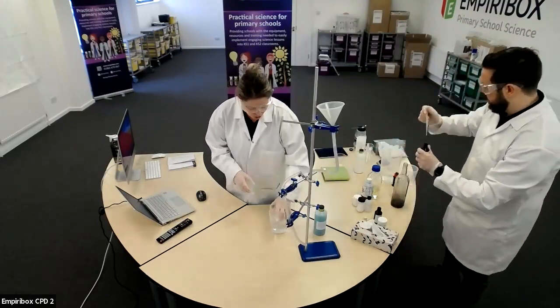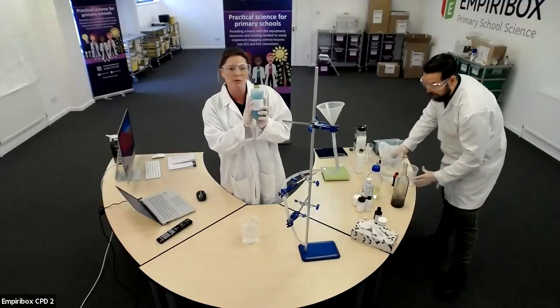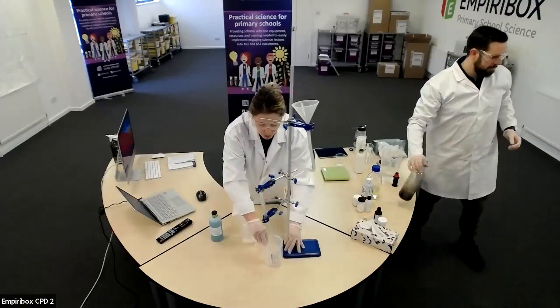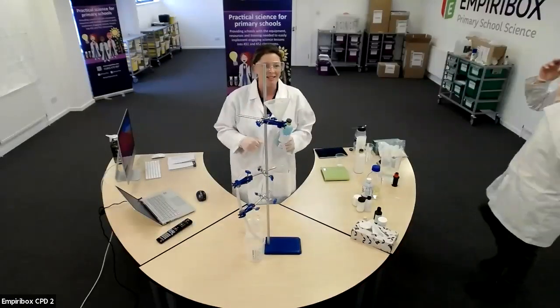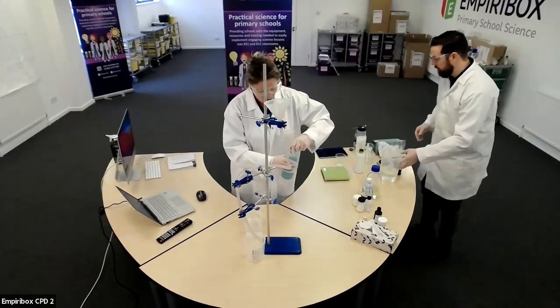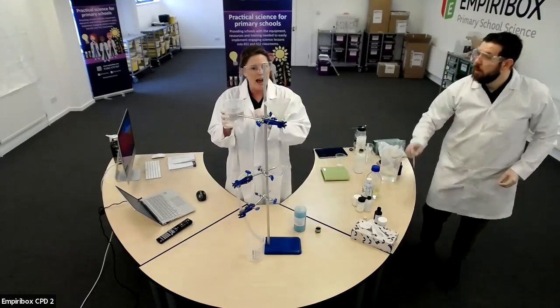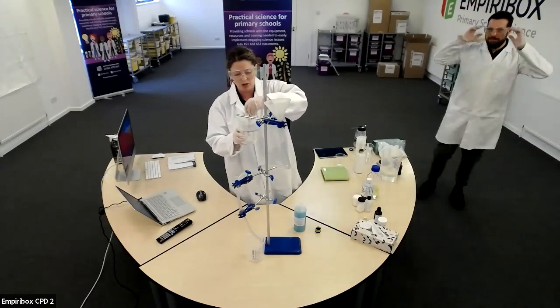So what Chris has done here is he has put into the bottle my chemiluminescence mixture. Chris, as I said, is our mad scientist who makes sure that all the chemicals are pre-prepared. So when you get your equipment from Empiribox, you don't have to worry about mixing things together. It all comes in these ready done bottles for you. So I'm going to take my chemiluminescence mixture, along with a beaker which has got water in it and just 1 ml of hydrogen peroxide. Give that a little bit of a stir to make sure that it's all fully through.